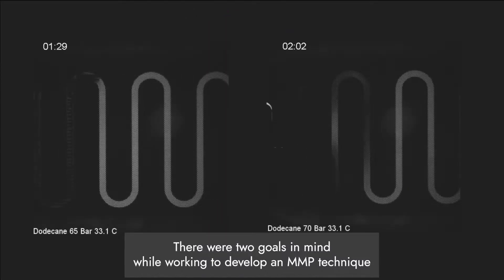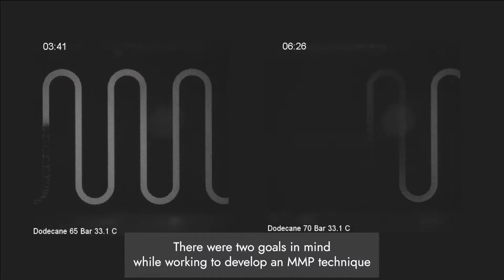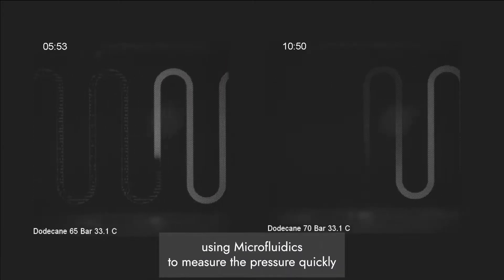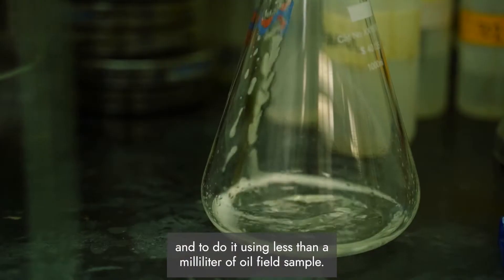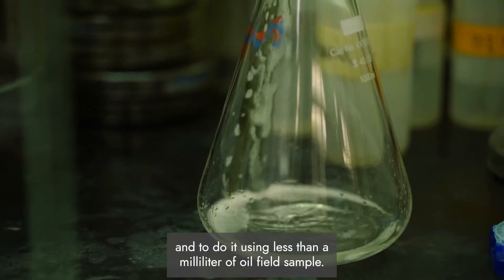There were two goals in mind while working to develop an MMP technique using microfluidics: to measure the pressure quickly, and to do it using less than a milliliter of oil field sample.